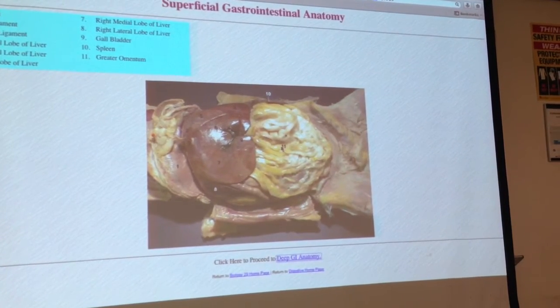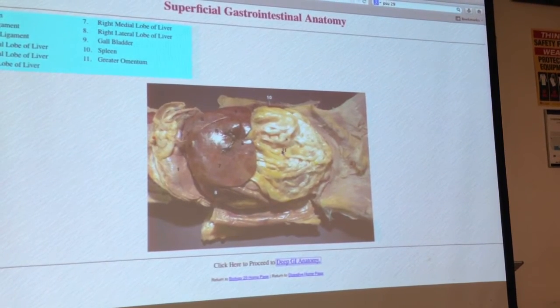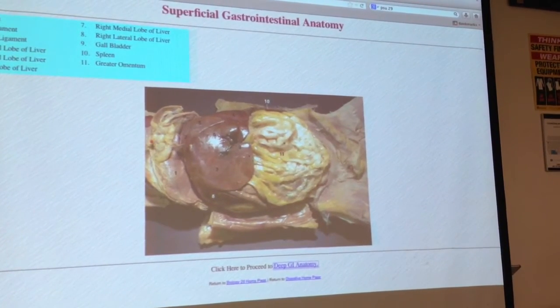And if it does fall apart, that's totally fine. It happens all the time. Do your best to keep it intact. If not, anything that comes out, just put it in the cat bits. Okay? You'll see that this is all going to gather on the stomach, and I'll point that out again on the next view, but I just want to show you the other things we can see externally.